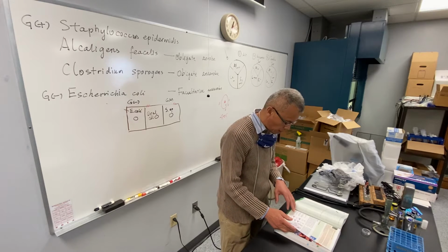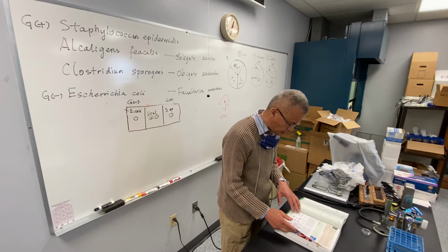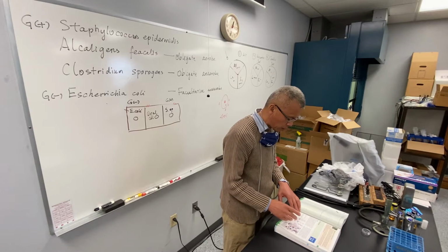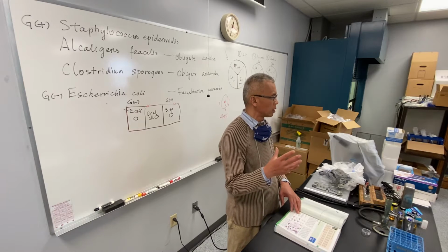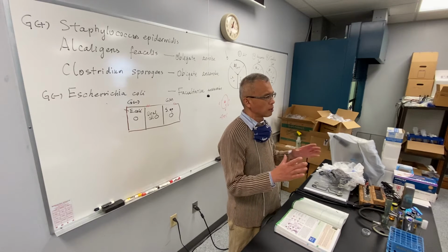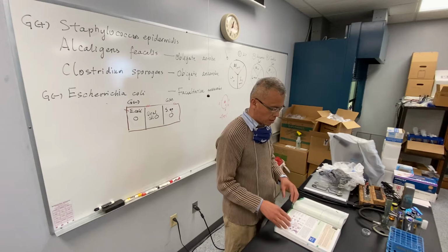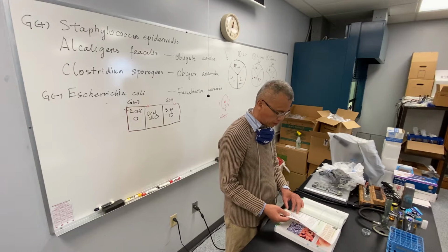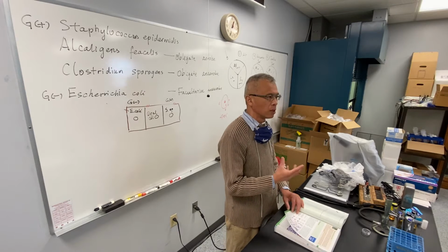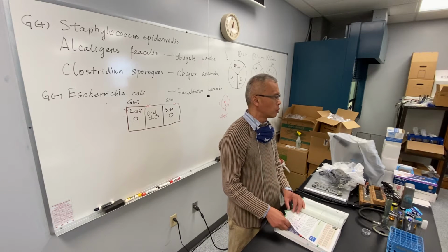In between, we use iodine. After the primary stain with crystal violet, you add iodine. Iodine will immobilize the dye in the cells, so that the Gram-positive bacteria cannot be easily decolorized by alcohol. But the Gram-negative cells still cannot retain the dye.